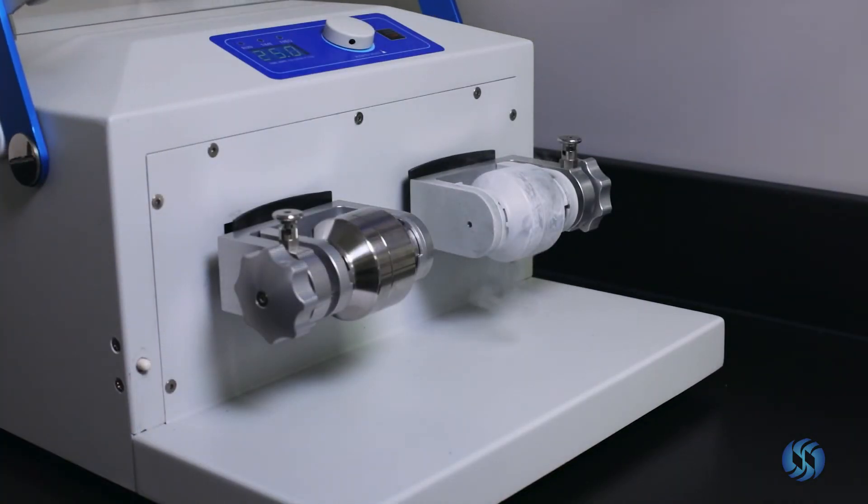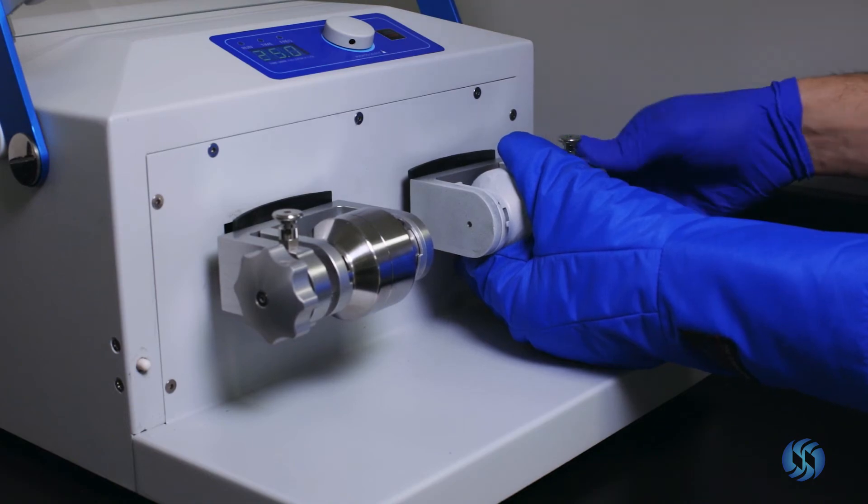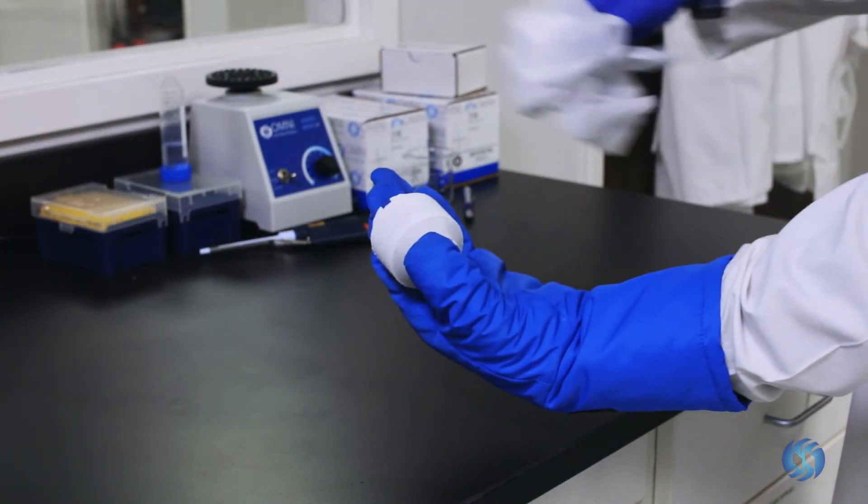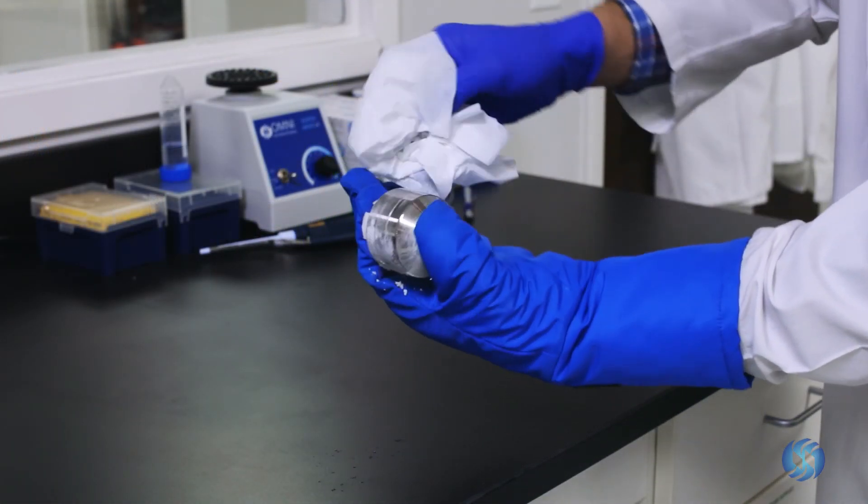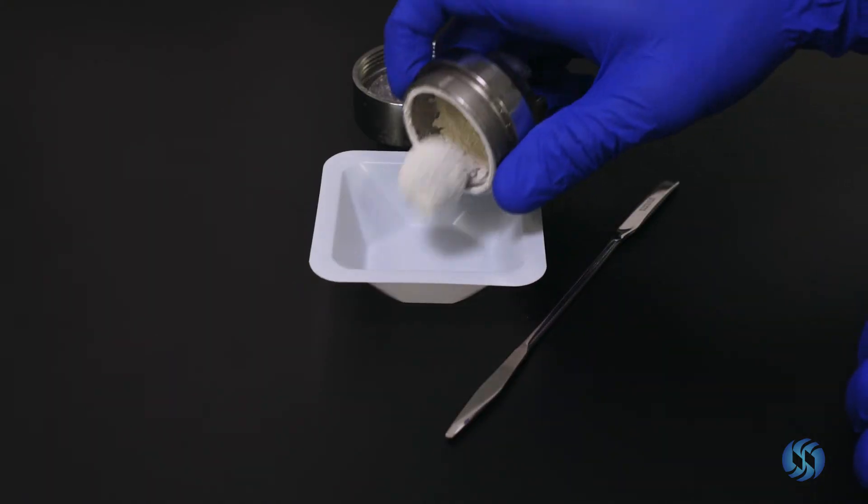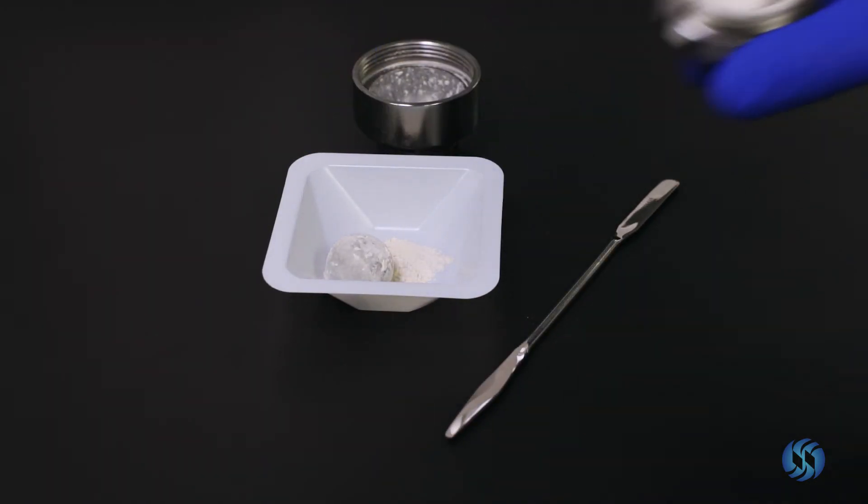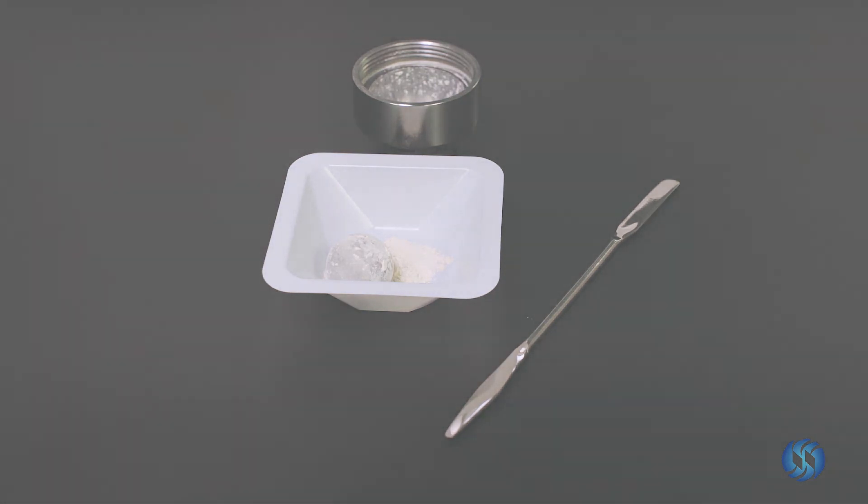Upon completion, unfasten the milling jar from the B-Rupter 96 and remove any excess condensation. Your bone sample is now ready for DNA and protein extraction.